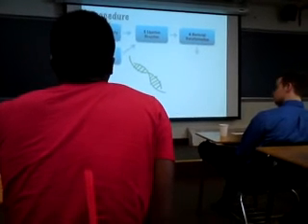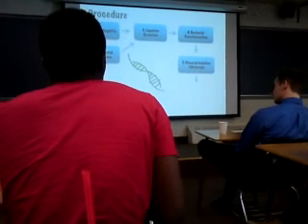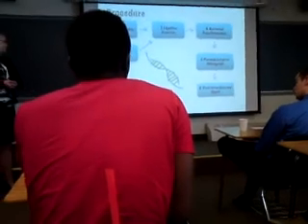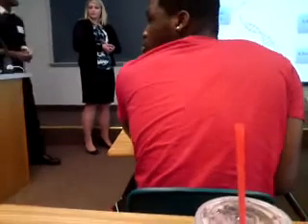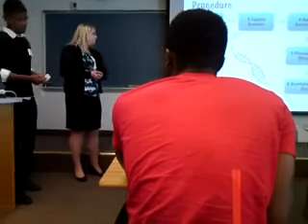The replication process will create colonies. Colonies will be isolated in the mini prep procedure. And moving on, the last procedure is the restriction enzyme digest. We're going to cut the plasmid using the restriction enzyme, and run a gel analysis to look at the results. In the upcoming slides, we're going to look in detail at all six major experiments.